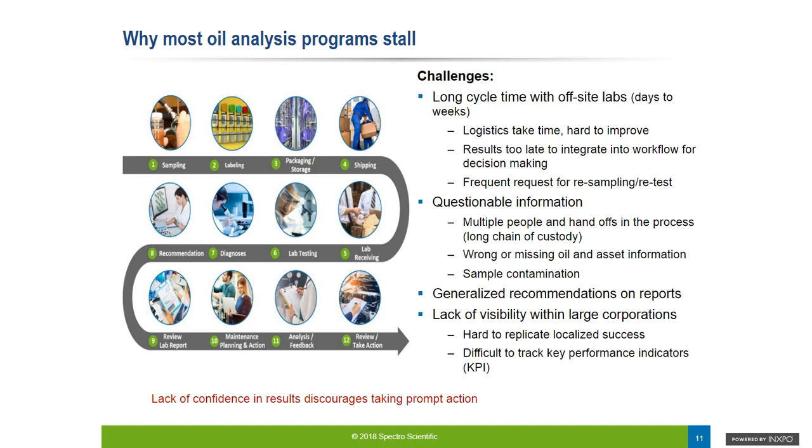First thing to notice is that the predominant deliverable for oil analysis is usually some sort of off-site or contract laboratory. And there's a process that's involved. The process essentially is where you have a series of samples that are pulled by the end user, shipped off to a lab, results come back in some form of either originally a paper or a fax report, and then there is some discussion on action items, and then it's supposed to be a feedback loop in order to improve the process.